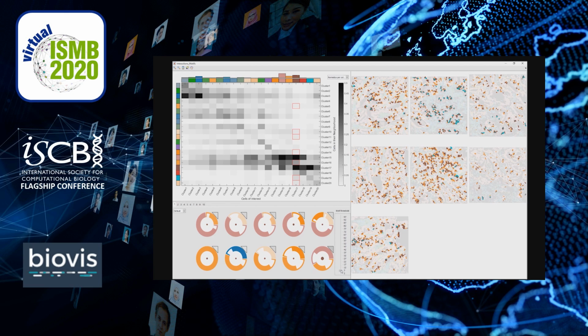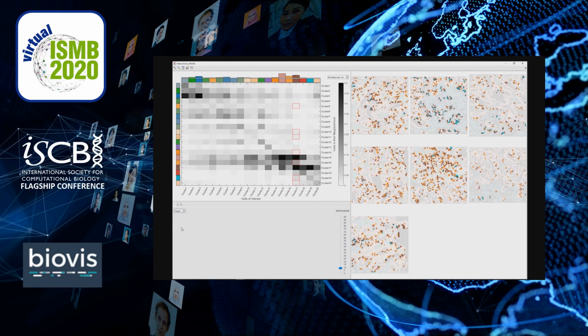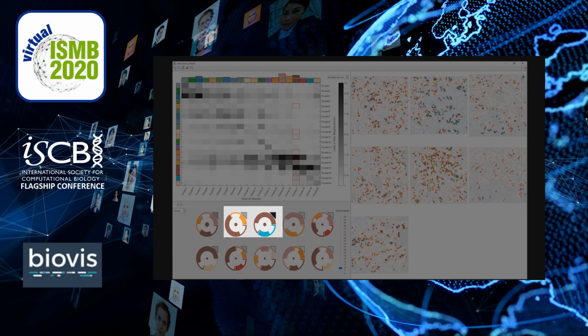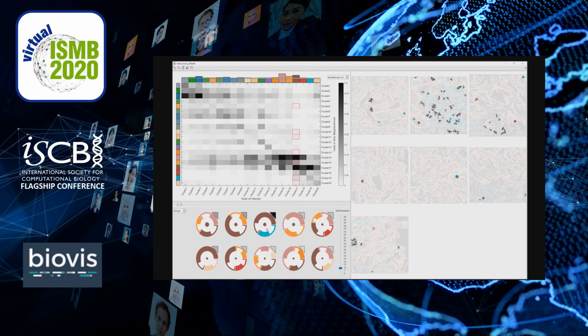We set the threshold to the minimum number of cells that should be grouped in a motif. Sorting the motifs according to the frequency of occurrence allows us to locate cells that occur with high frequency and have only cancer and infiltrated cancer cells in their microenvironment. The two selected motifs meet the target criteria. However, the light blue cluster consists of significantly fewer cells than the orange cluster. Finally, clicking on the motif, we can relate it to its spatial location.